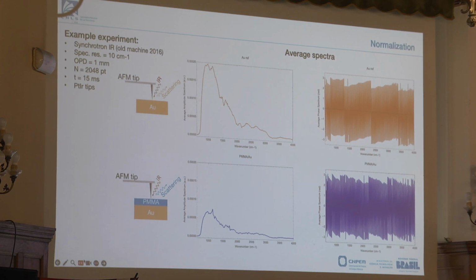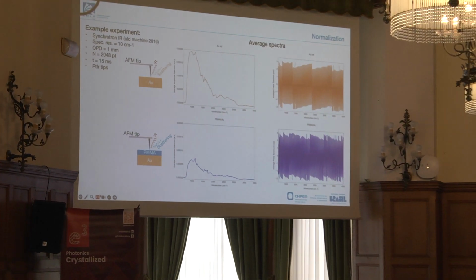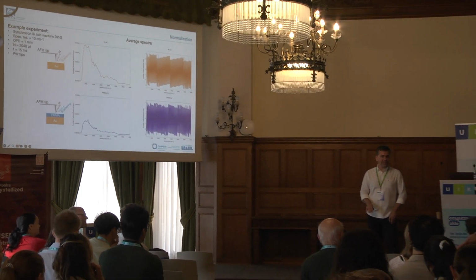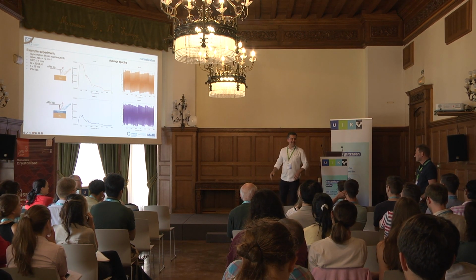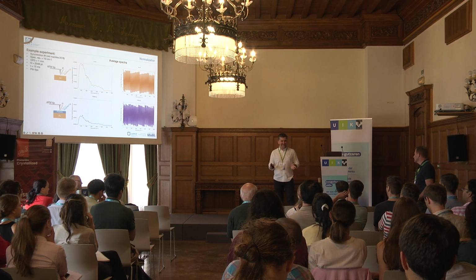Yeah, this is actually a really good idea. I mean, now when I have users who just want to measure nano-FTIR absorbance, I will never do a reference spectrum anymore. I would just shift the interferogram to 0, and that's it, right? That's what you're talking about.